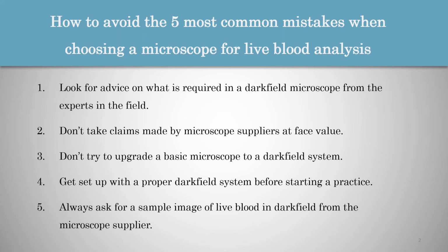Then the second point touches on the same principle: it's important not to just take claims made by microscope suppliers and manufacturers at face value. This has especially become more of an issue recently with online shopping, and there are a very high number of microscopes being sold online as dark field microscopes, and many of them are sold as live blood analysis dark field microscopes, but they do not fulfill all the necessary requirements for these microscopes to actually work properly in dark field.